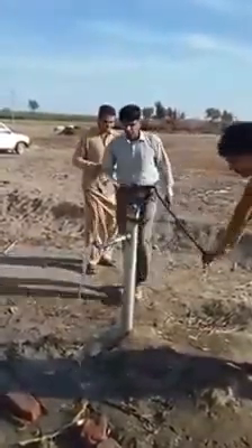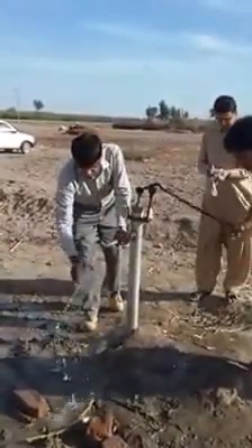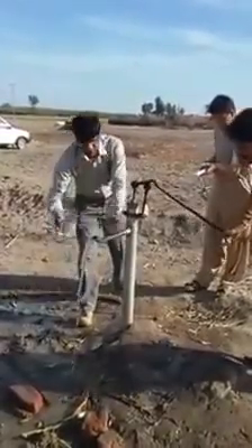Now I am washing the equipment using the same water from this hand pump, and I will collect this water sample for analysis.